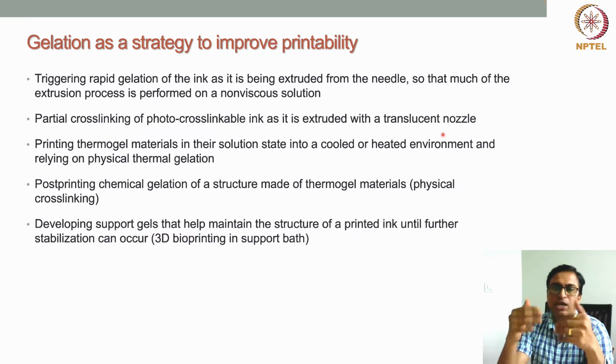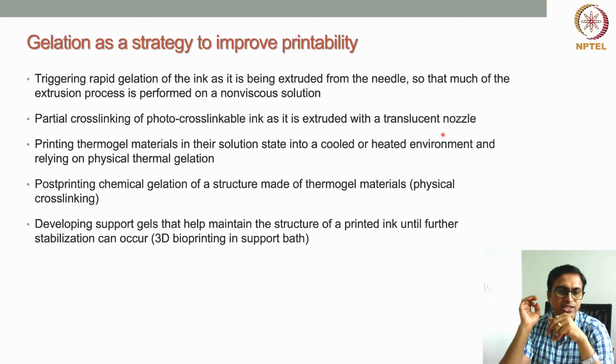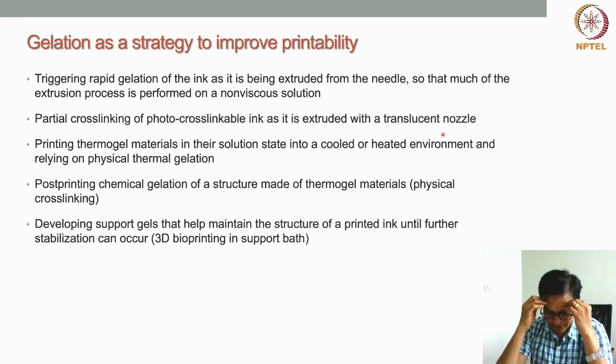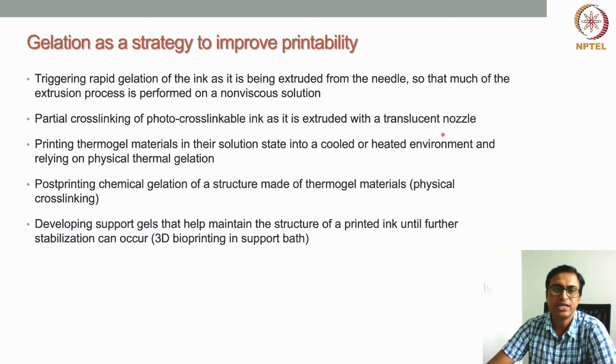The same thing can also be done with gelation. A rapid instantaneous gelation of the material as soon as it comes out of the nozzle can be done. So triggering rapid gelation of the ink as it is being extruded through the needle, so that the extrusion process is performed on a non-viscous solution.